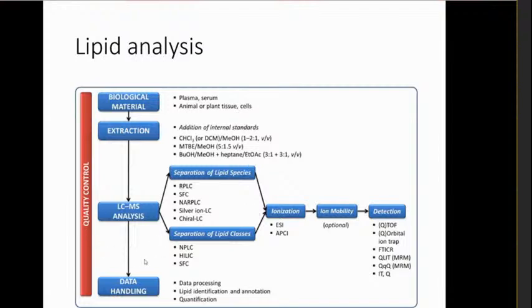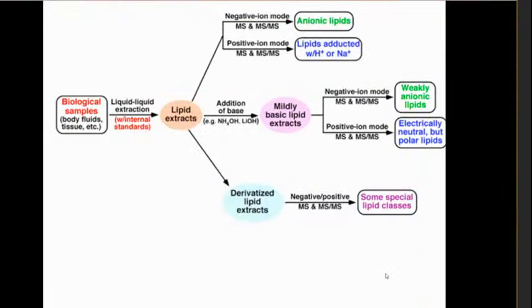Once we inject the lipids into reverse phase liquid chromatography, we can separate the various kinds of lipids. Then comes the ionization process and detection of the various molecules. This is another workflow for the separation of lipids.